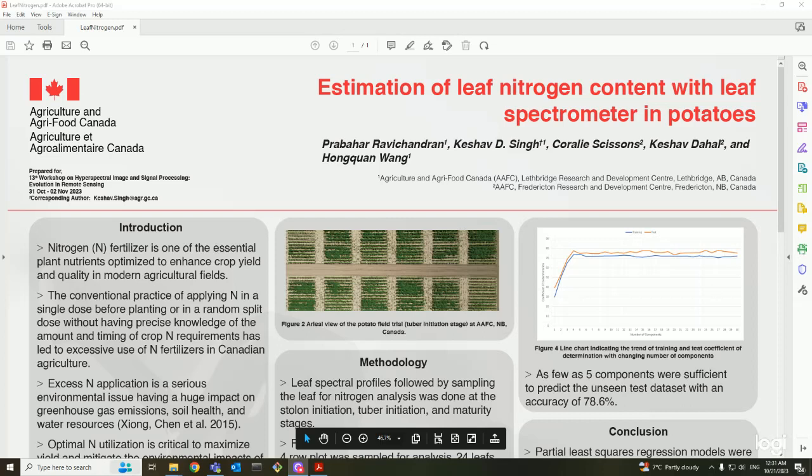I'm a research biologist working for Agriculture and Agri-Food Canada in Lethbridge, Alberta, Canada. The topic of today's discussion is estimation of leaf nitrogen content with leaf spectrometer in potatoes.